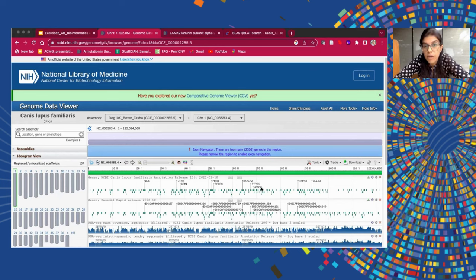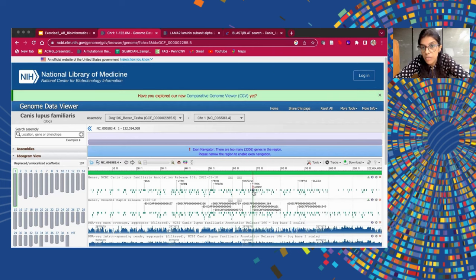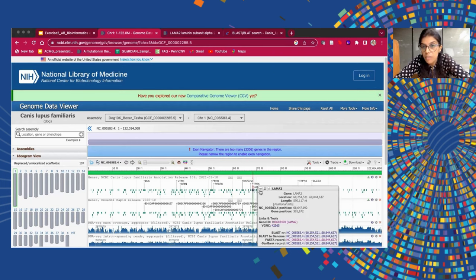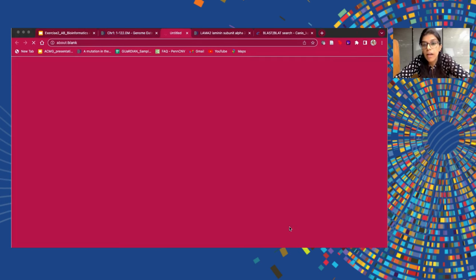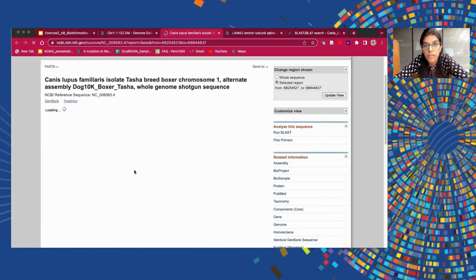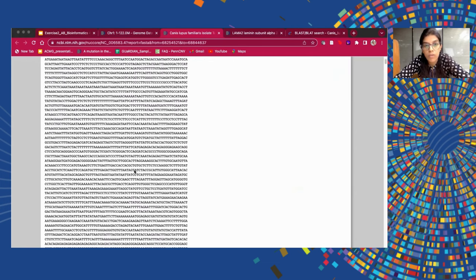Let us choose the gene known as LAMA2 and try to download its sequence from here. When we hover on the LAMA2 box shown in small green color, an information tab will open telling you the name of the gene, its location on the chromosome, the length of the gene, the position, and the NCBI ID as well. If you want to download the FASTA sequence of the gene from here, you can click on it and it will open in another tab where the entire sequence of the gene is present, and you can download the sequence from there.